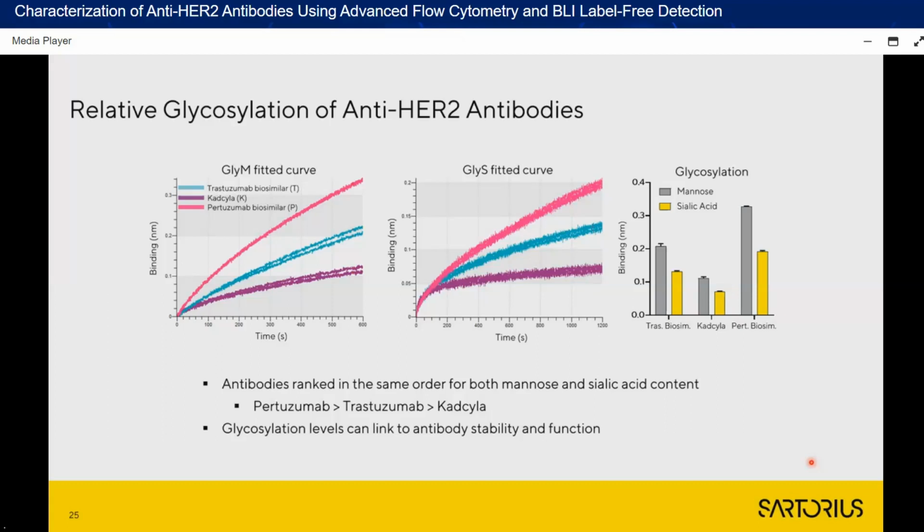Although obviously this is going to require some further exploration, because the pertuzumab didn't fit with that theory, showing both high-level glycosylation and sensitivity to the heat denaturation. Also, glycosylation can indicate things such as Fc function, but again, I think this is going to require some further exploration and also a larger sample size in order to really start to uncover links between these metrics.